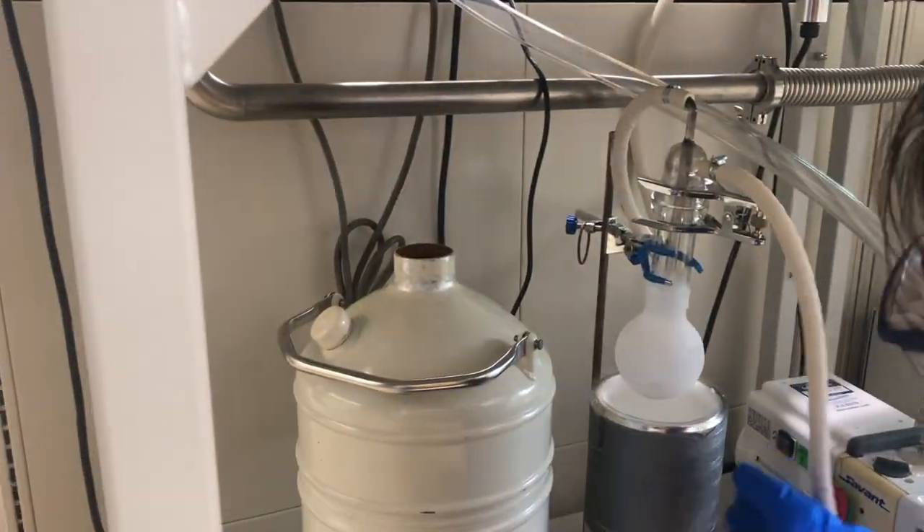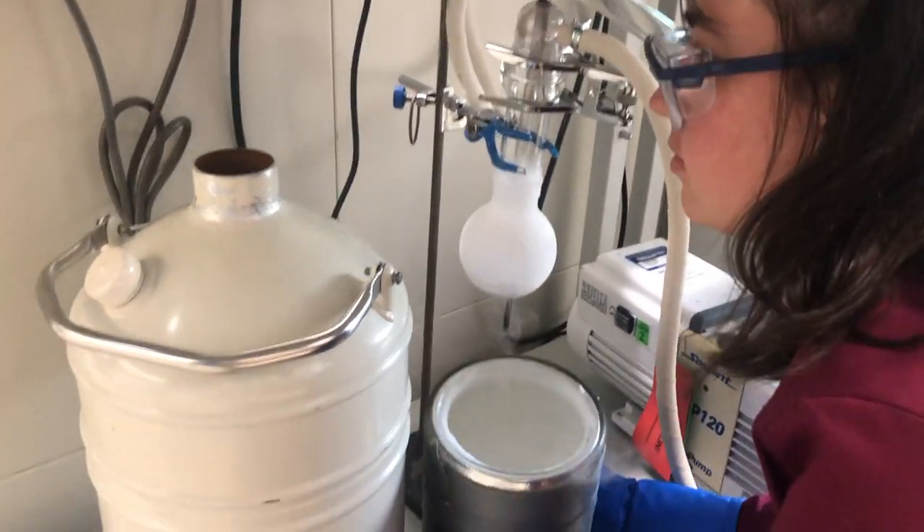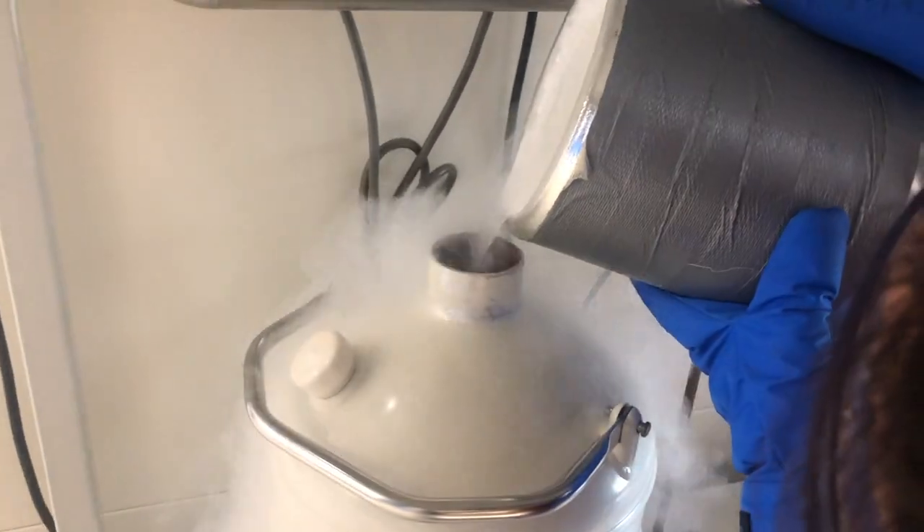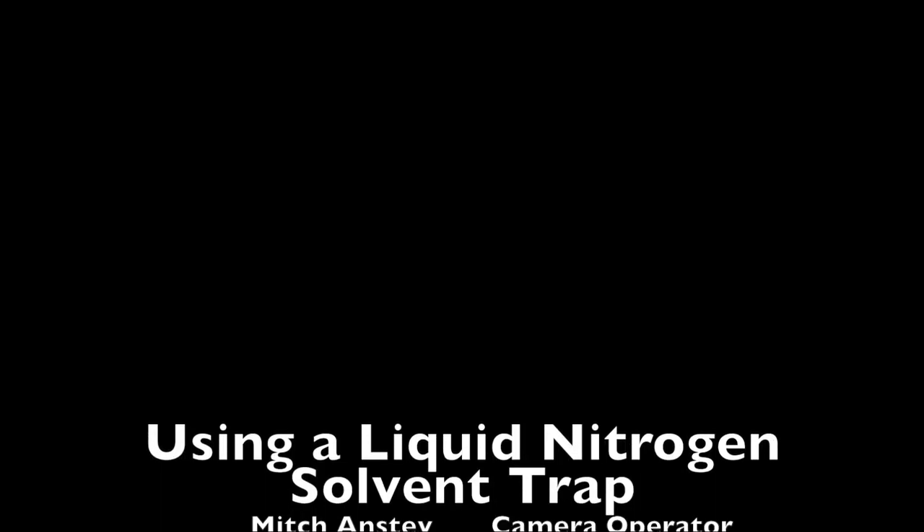Next, you should pour the remaining liquid nitrogen back into the storage Dewar so that we can use it tomorrow. We will leave the trap to warm to room temperature all by itself. You should be able to use it tomorrow.